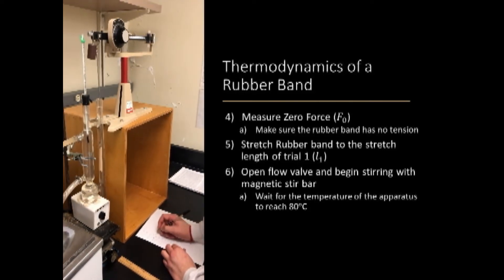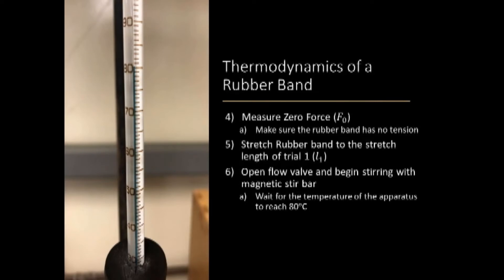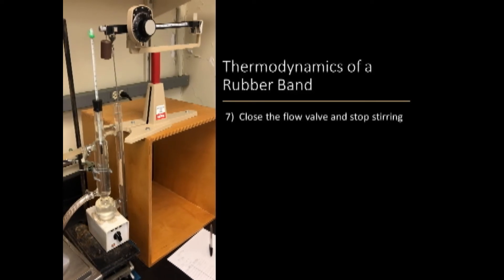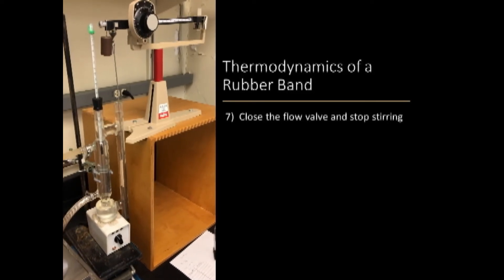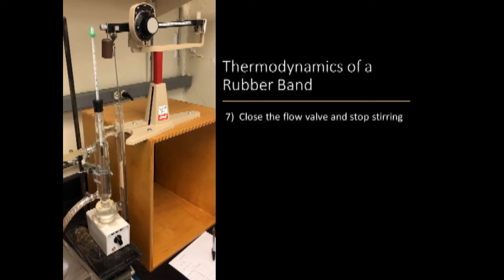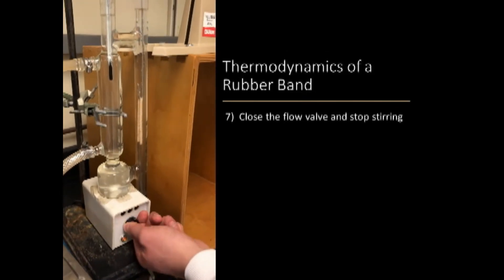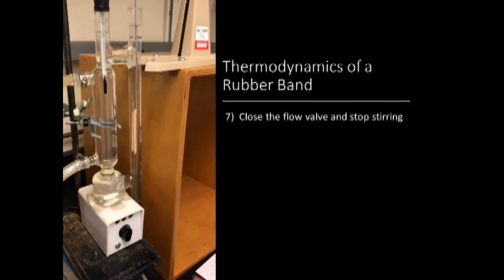Then wait for the temperature of the apparatus to reach 80 degrees Celsius. After you reach 80 degrees Celsius, you will close the flow valve and stop stirring before leveling the scale and recording your force, temperature, and length measurements.